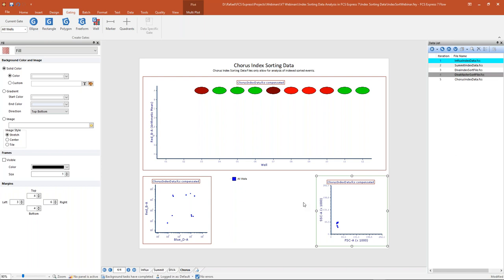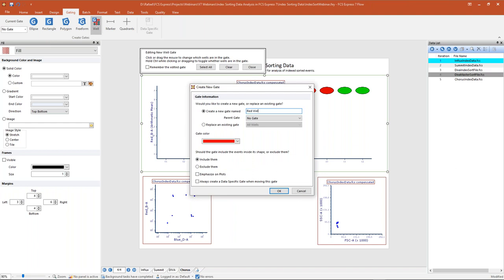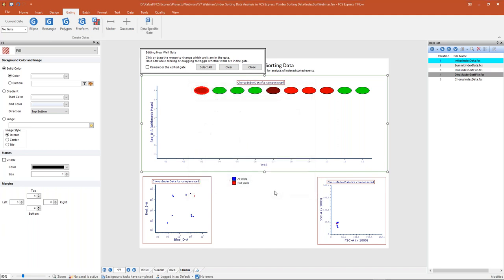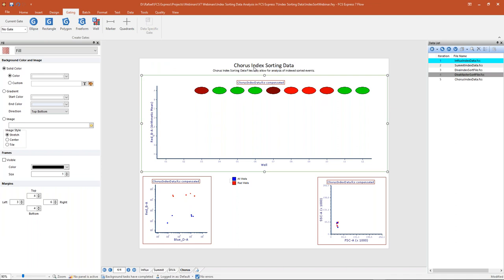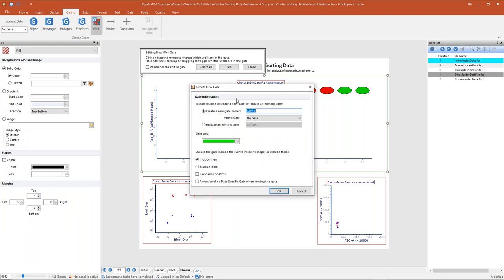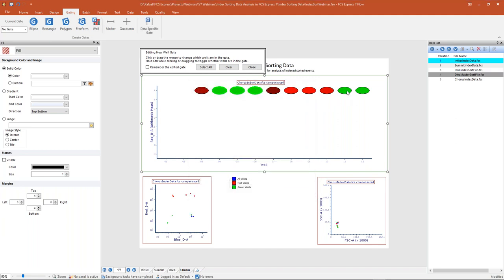Even with our all wells gate created, we can still create well gates on single wells or multiple wells. I'll select a subset of my wells — my red wells — making a gate on those. I'll click on the well gate, grab one of these red wells, call this our 'red wells gate,' leave it red, emphasize on plots, click OK, then hold down Control to pick the rest of those red wells. We can continue adding more gates — for example, adding another gate for our green wells by clicking the well gate, selecting the kind of gate we want, picking what's included, emphasizing those gates on our plots, and holding Control to multiple-select all the green wells.